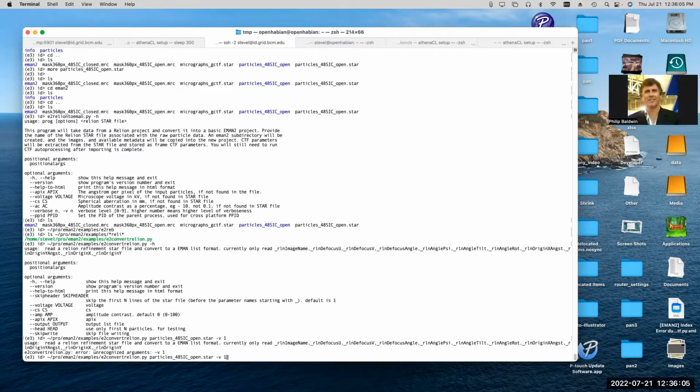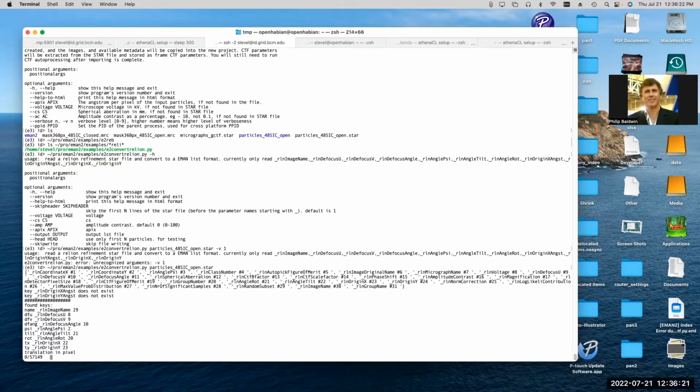Oh, Steve, can you tell me how many lines are in the star file? I'm trying to get a feel for the numbers. Oh, actually, it doesn't have a verbose option. That's fine. Okay, so we've got this running. So what did you ask, Phil? How many lines? Well, there were 57,000 particles in the file, so there are a few more lines than that, just because of the definitions of the columns.